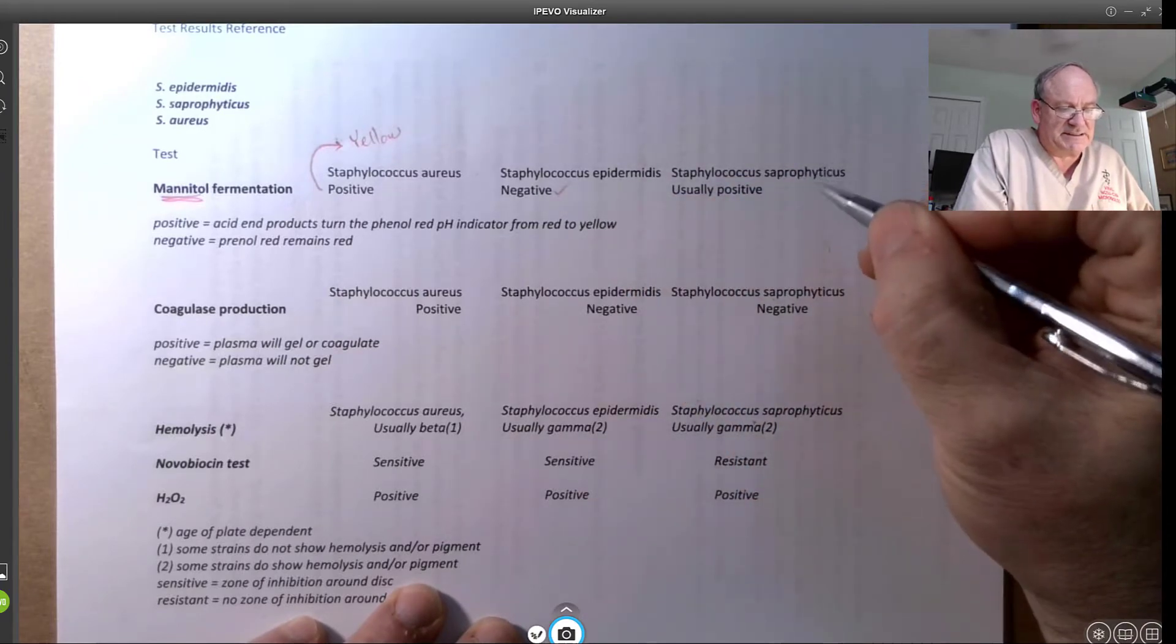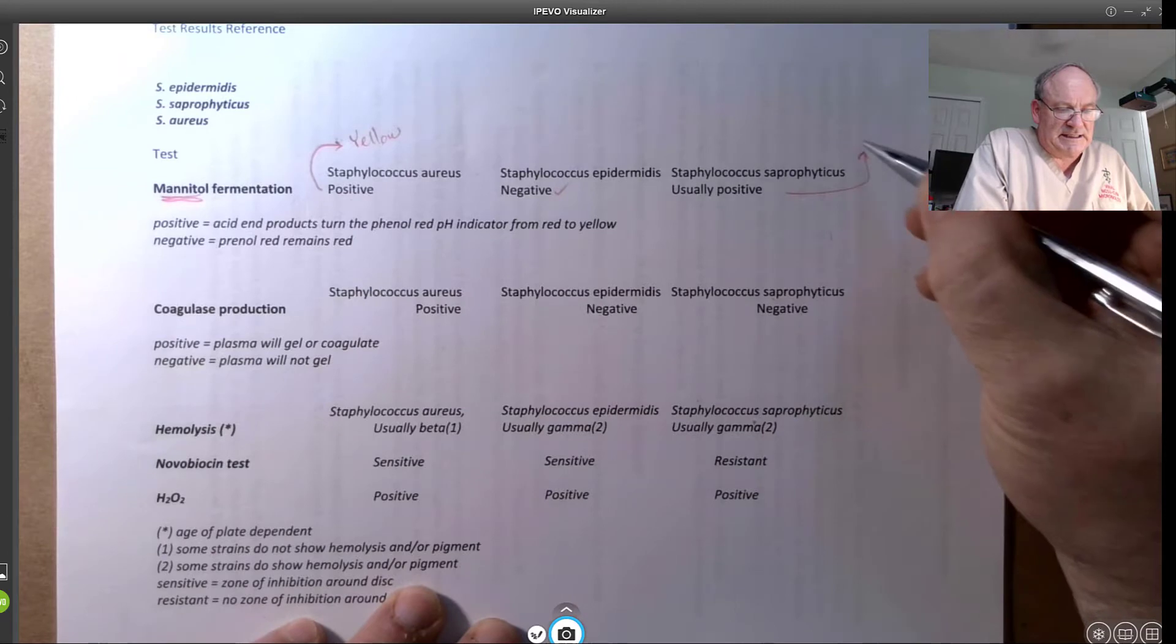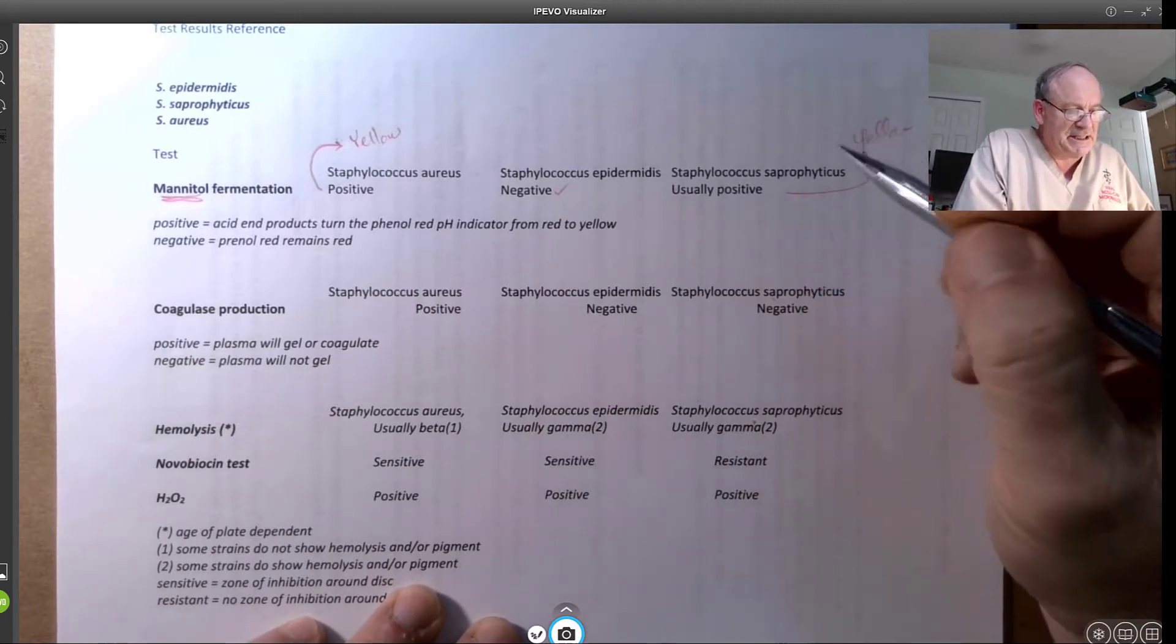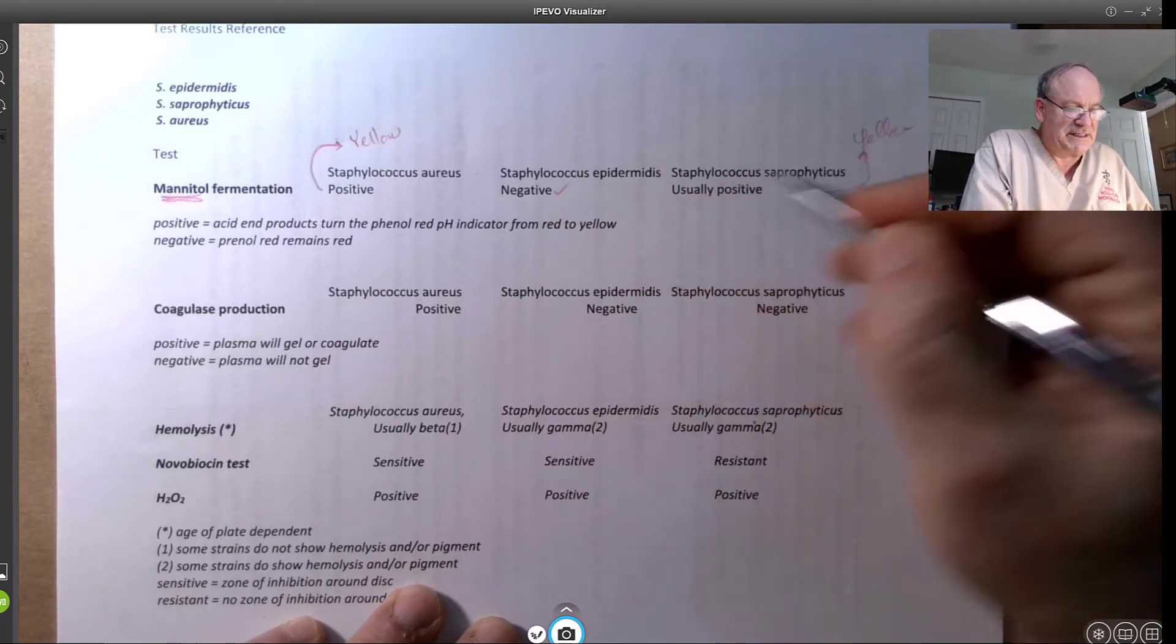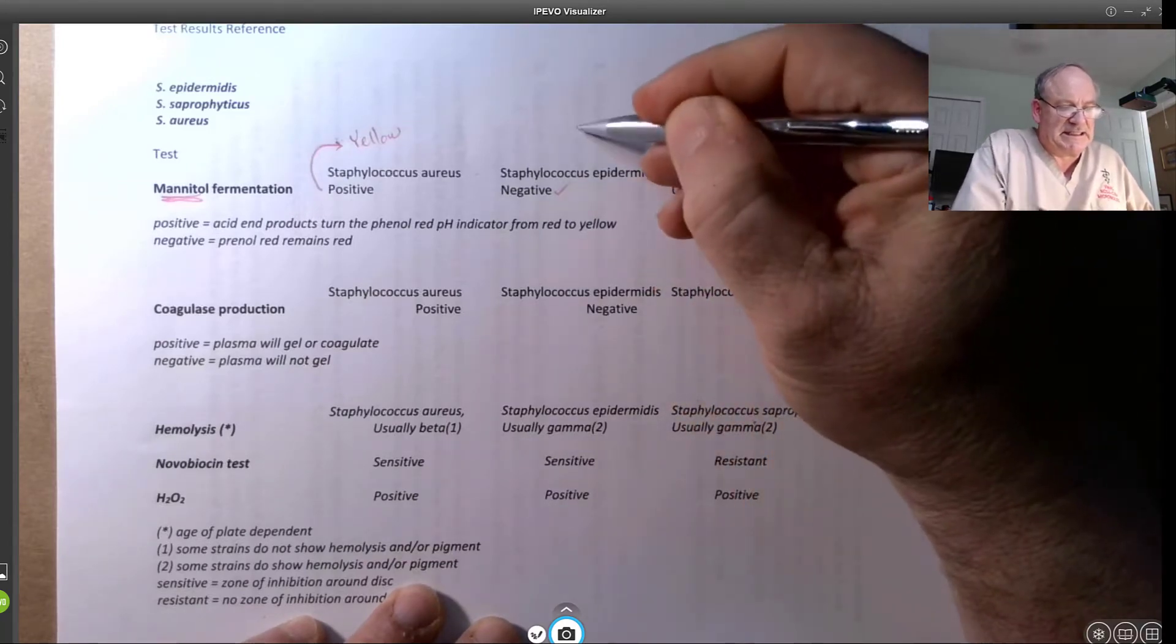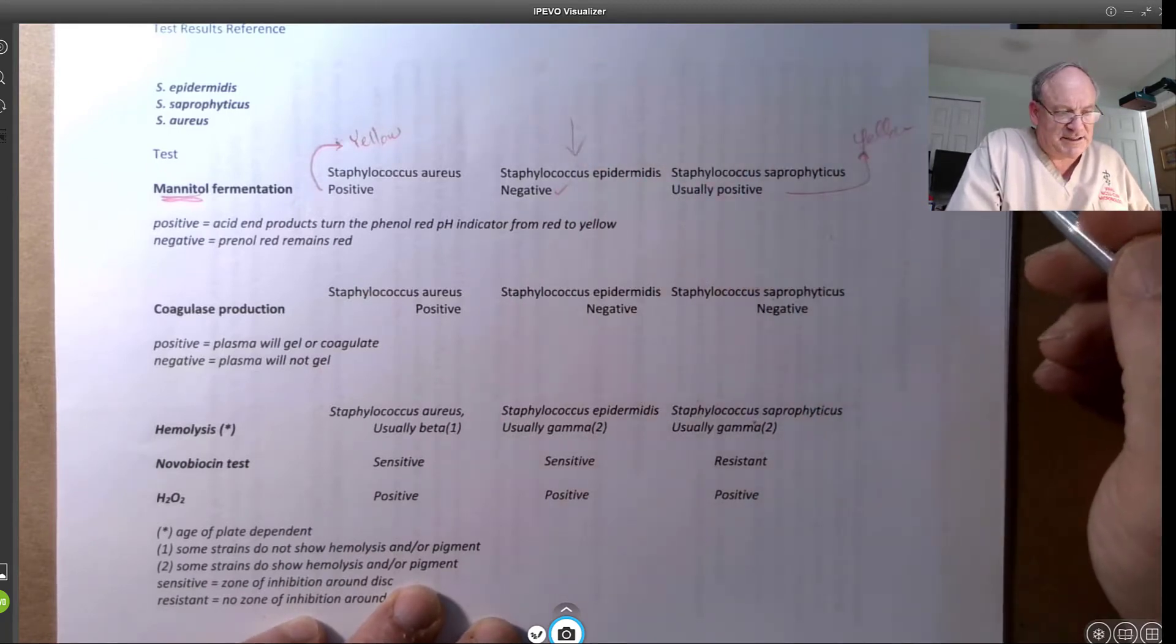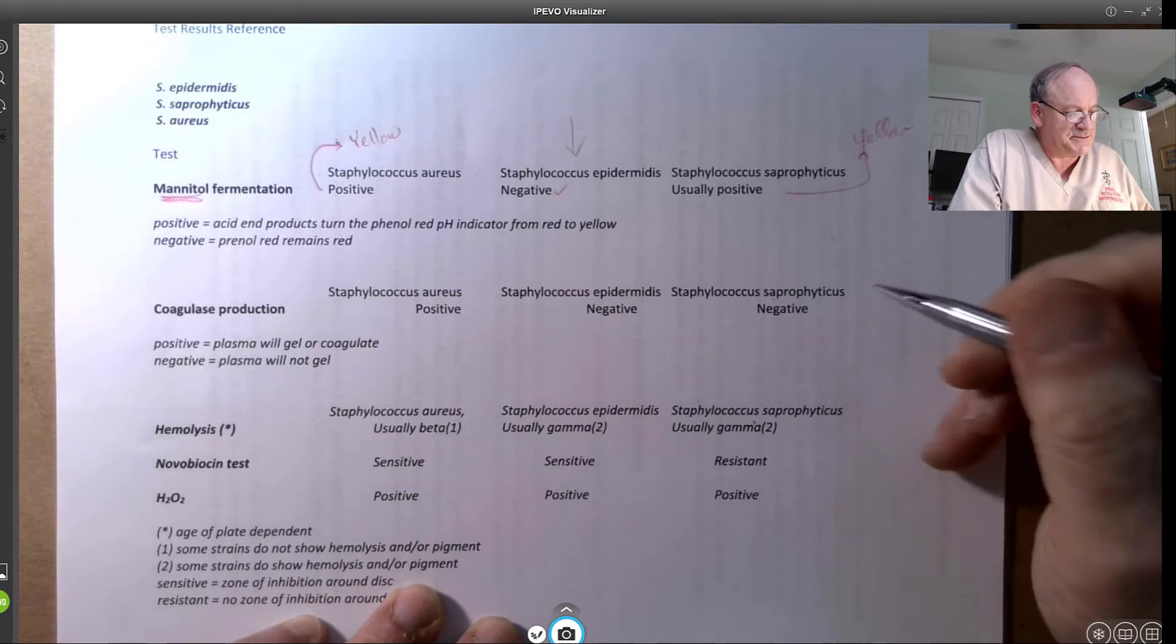Staph epidermidis is negative, and the saprophyticus will be also yellow, positive. And this helps us turn the tide in terms of identifying at least one of these Staphylococcus epidermidis as a possible selection for identification.